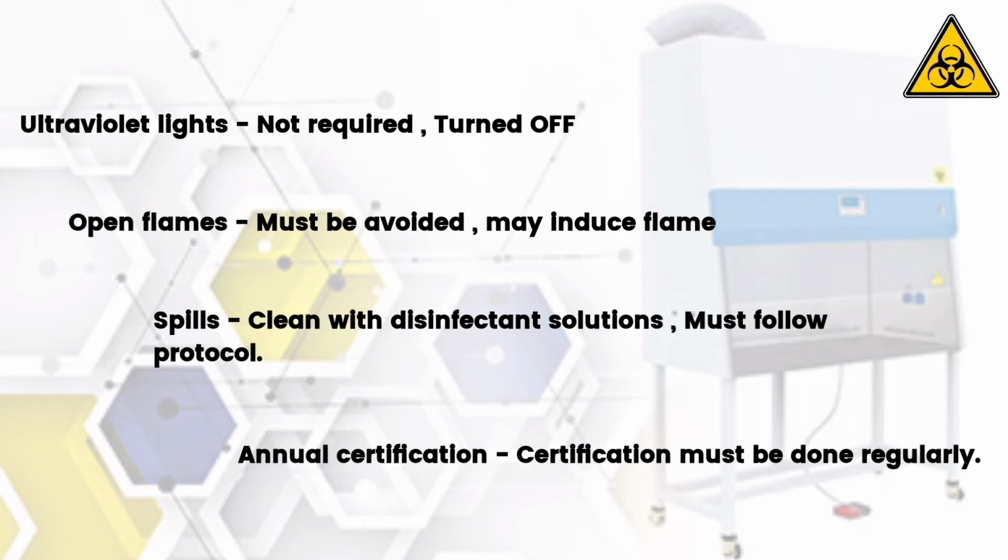What is the use of annual certification? Biosafety cabinet must be certified regularly and at the time of installation to national or international standards. Regular tests must be performed by qualified professionals. The tests include velocity of airflow, leakage in HEPA filters, electrical leakage, ventilation rate or negative pressure rate, noise and vibrations, light intensity, etc. Special trainings are given for professionals to perform these tests.